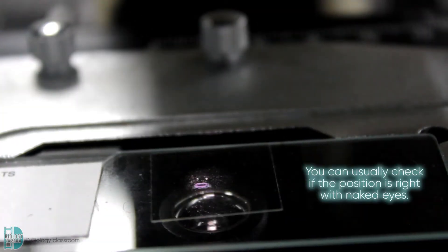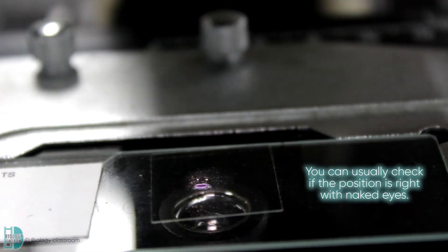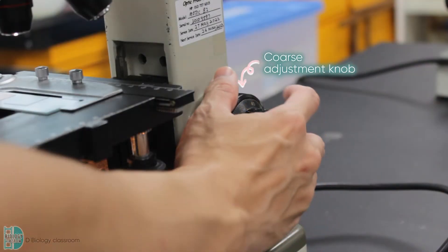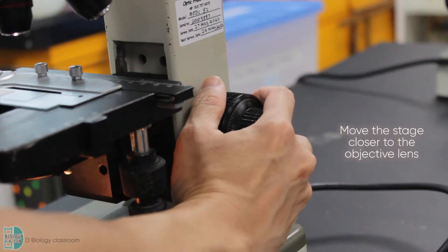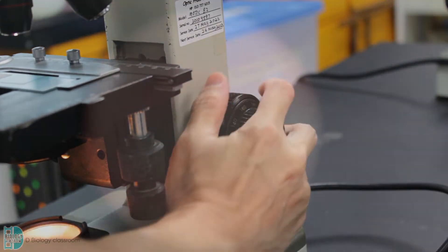Just use your naked eyes to check if the position is right. This ensures your specimen is right below your objective lens. You can now look into the eyepiece. Use the coarse adjustment knob to bring the stage closer to the objective lens. Keep looking into the eyepiece and adjust the stage until you can see the specimen.